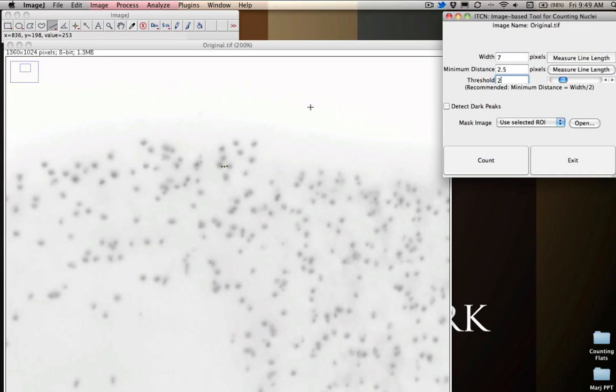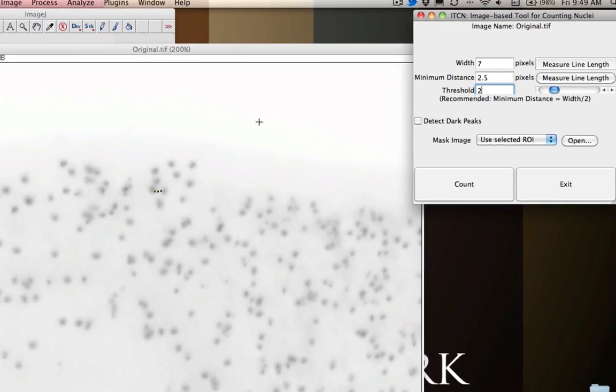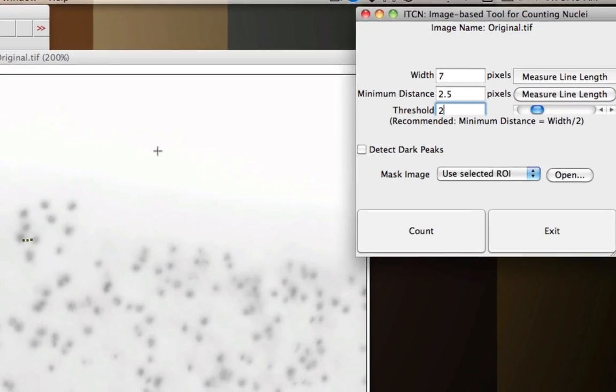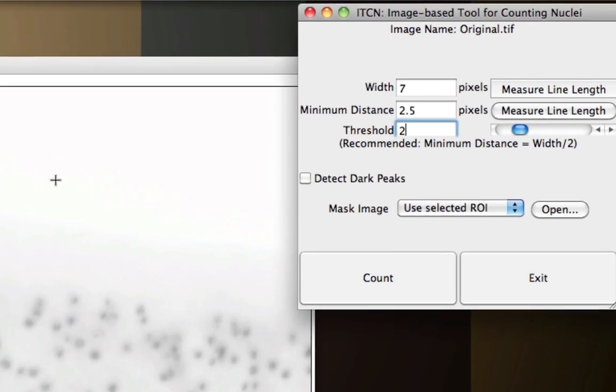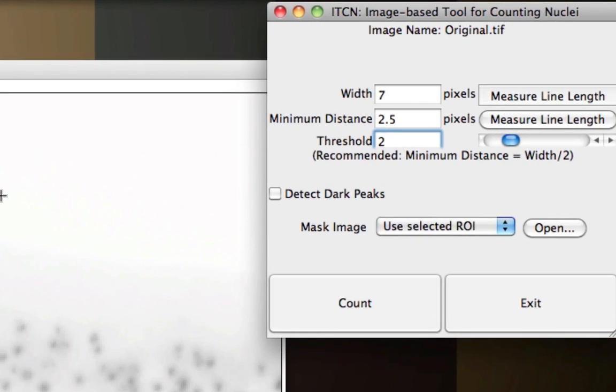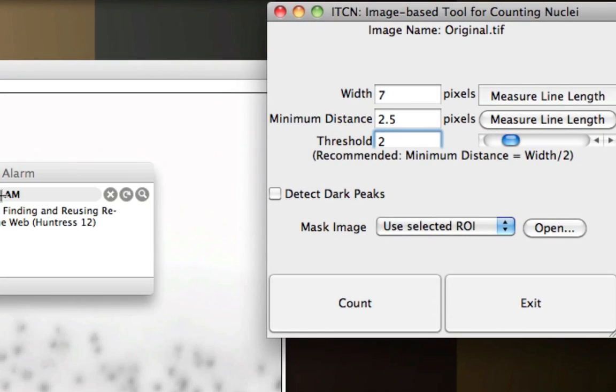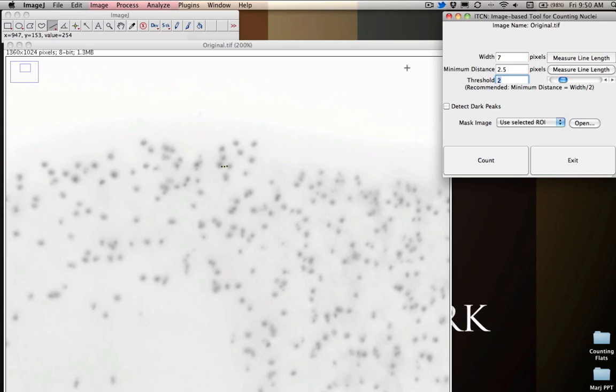So for this particular image, and you need to make sure that all of your images are standard in order for this measurement to work consistently. For these particular sets of slides, I'm going to go with 7, 2.5, and 2. Now that I've done all of this exciting stuff, I'm going to make sure this little area is clicked right here, Detect Dark Peaks, because this is going to make sure that it looks for dark regions on this particular slide.